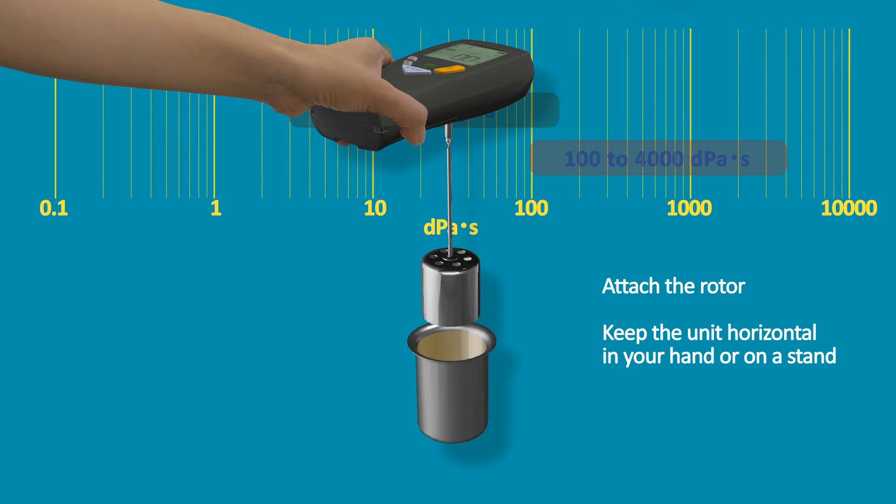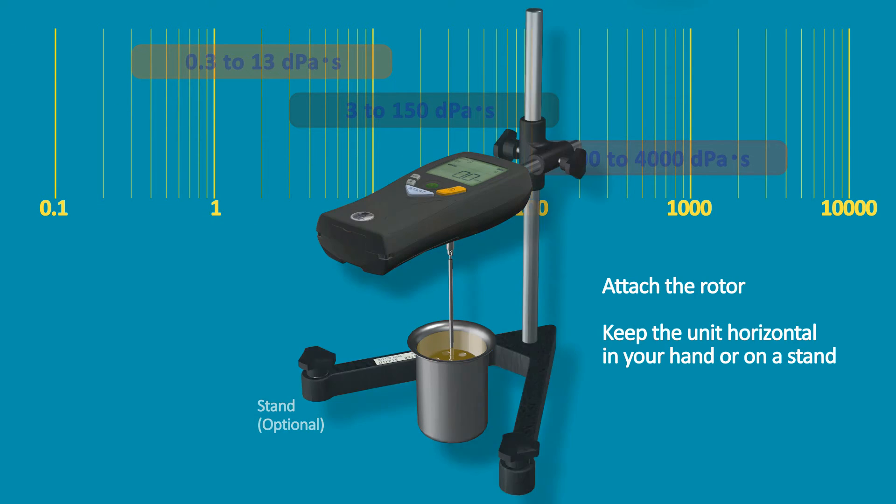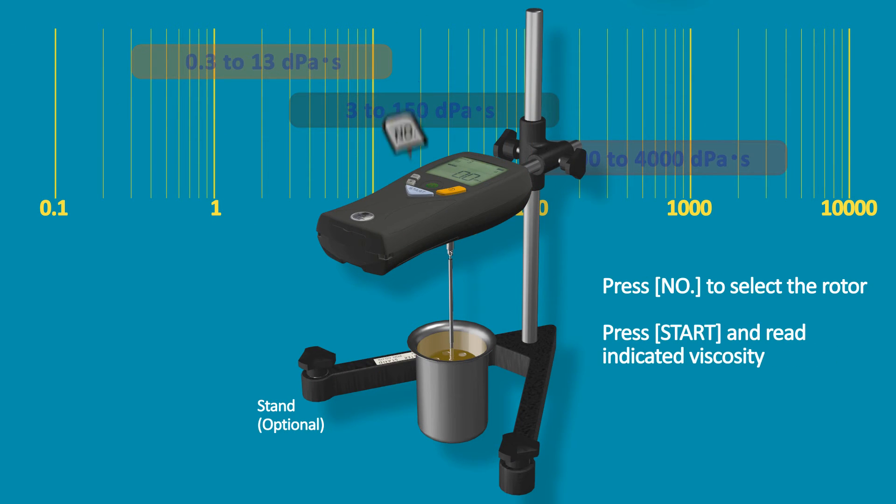Attach the rotor. Keep the unit horizontal in your hand or on a stand. Press the number to select the rotor. Press start and read the indicated viscosity.